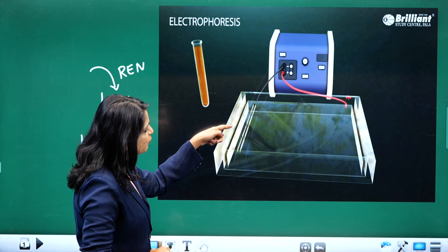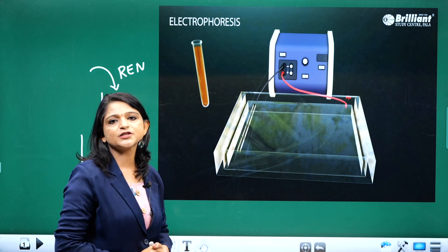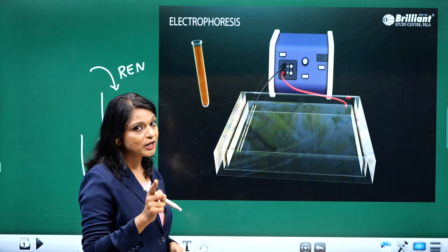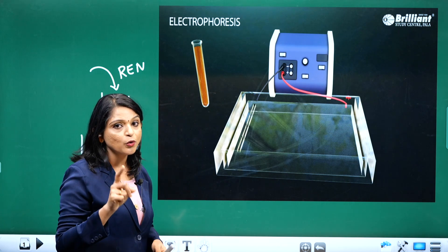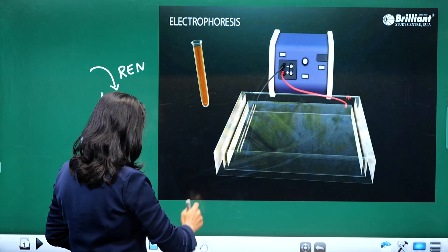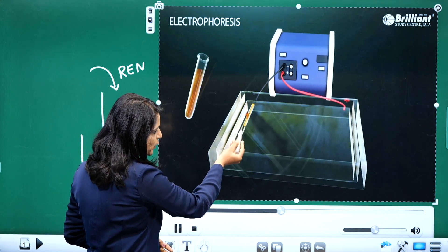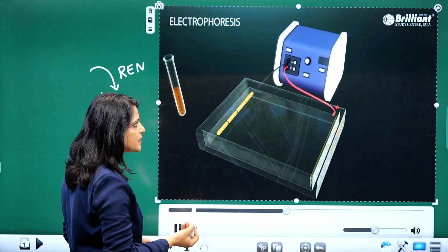The portion with the wells is connected to the negative electrode of the electrophoretic apparatus, and the opposite side is connected to the positive electrode. Next, I'm going to load the DNA into the wells. I'm loading the DNA sample into the wells, which are connected to the negative electrode.